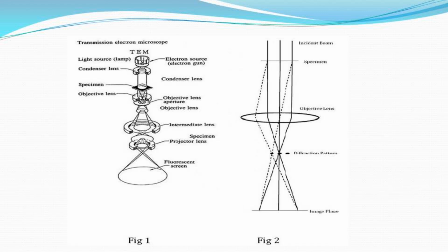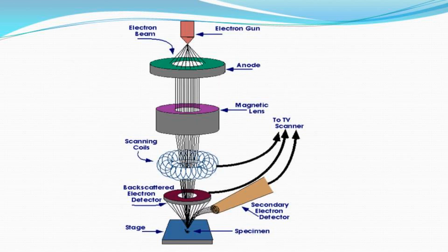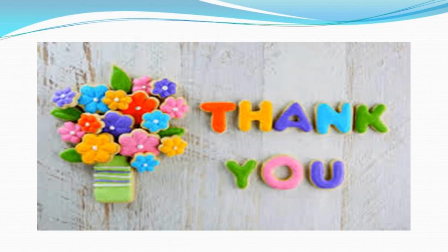This is a picture showing the working of transmission electron microscope. This slide shows the working of scanning electron microscope, where you could see the scanning coils are used to scan the surface. With this, we have come to the end of the session.